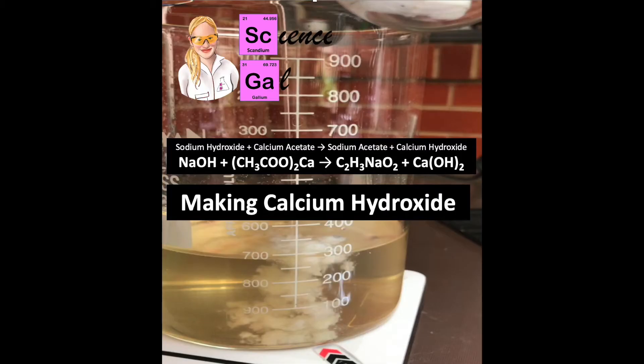In this experiment we are going to be making some calcium hydroxide by doing a double displacement reaction by adding two reactants, calcium acetate and sodium hydroxide, that will produce the two products calcium hydroxide and sodium acetate.